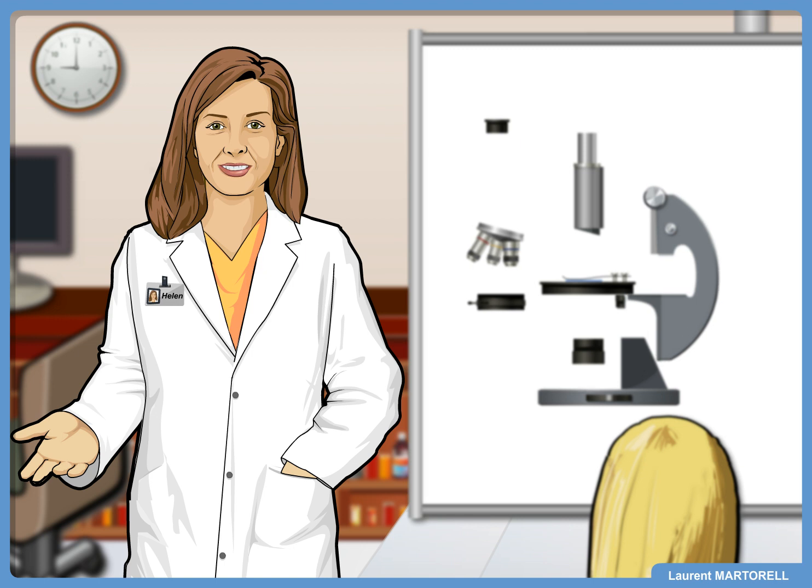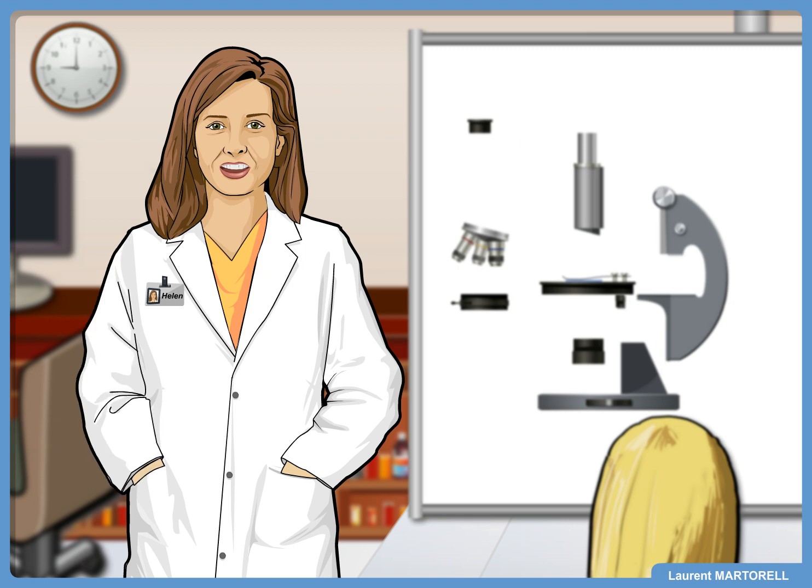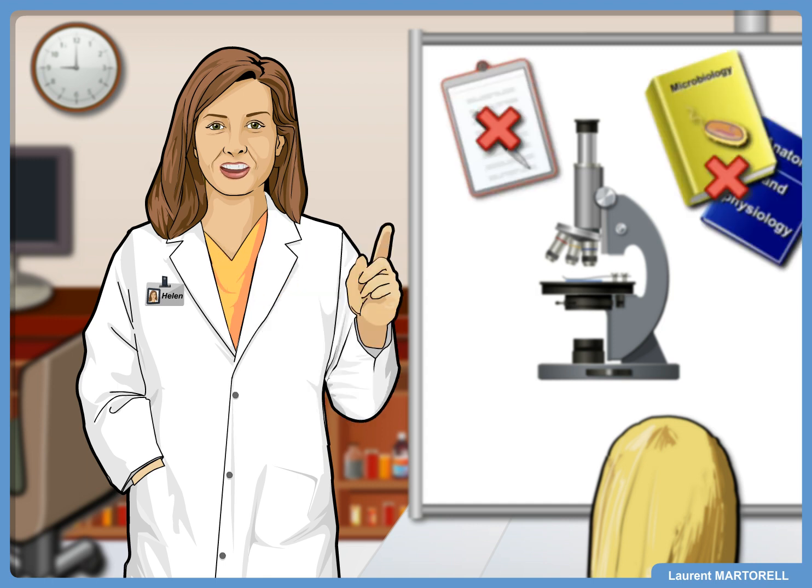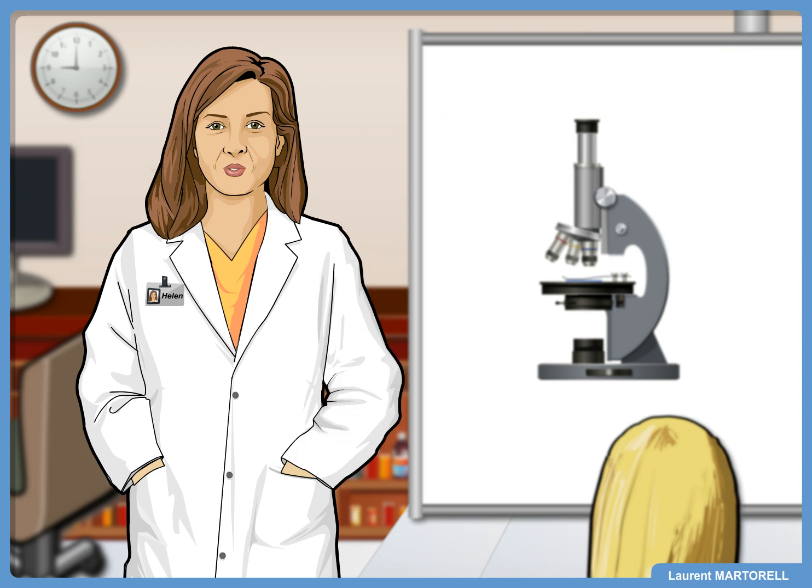In order to use it properly, you need to know what these different components are. So let's discover them. But before we go any further, make sure your lab bench area is cleared of any notebooks, textbooks, or papers. The part of the microscope that lies on the bench is the base, and always handle the microscope with care.